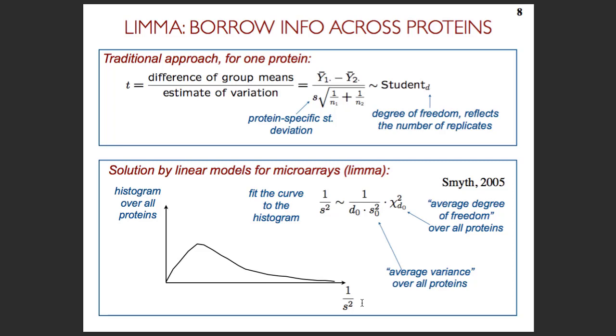You don't think they're the same type of normalization? So they may not necessarily be identical, but they're very, very similar, if not. So either is fine. That's right. But I would really say that LIMMA doesn't do anything with respect to outliers and censored values, and it is fairly limited in the type of designs that you can use.